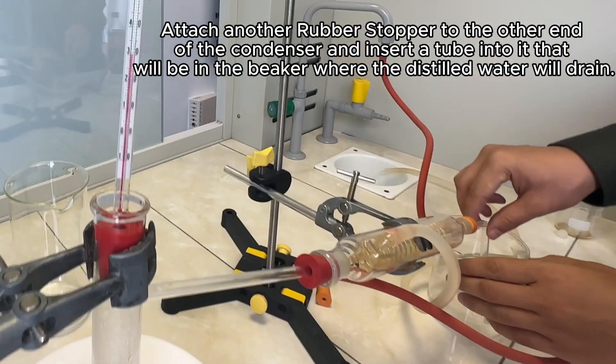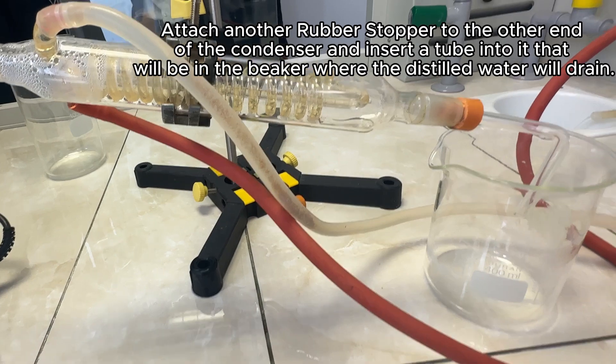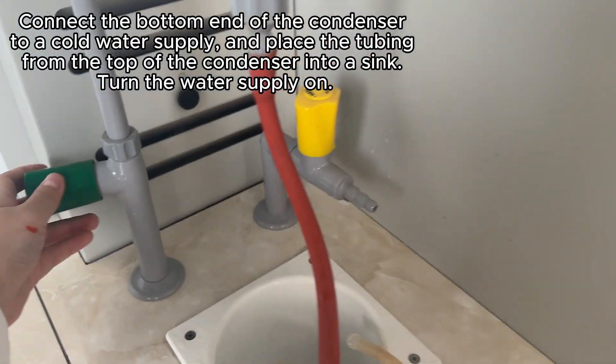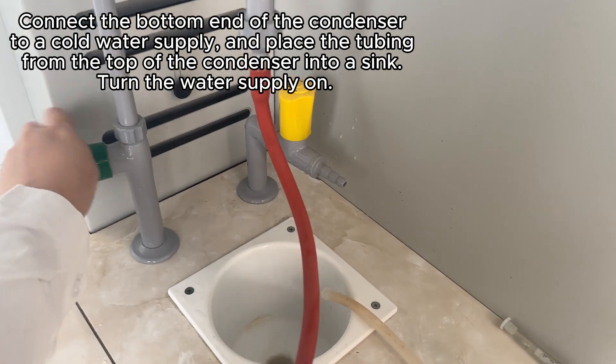Attach another rubber stopper to the other end of the condenser and insert a tube into it that will let the water drip into a glass. Connect the bottom end of the condenser to a cold water supply and place the other tubing into a sink. Turn the water supply on.